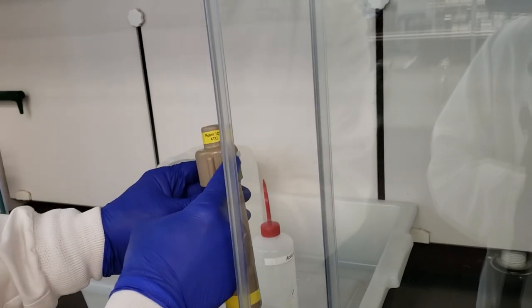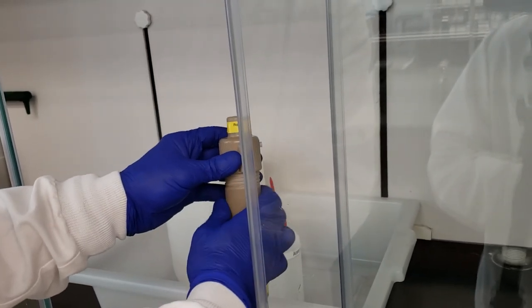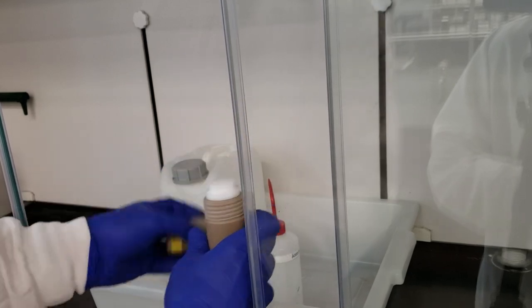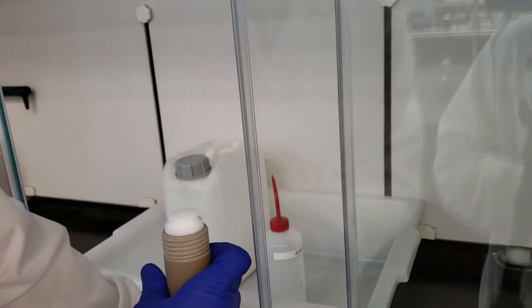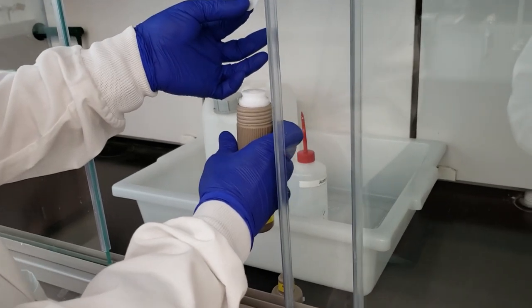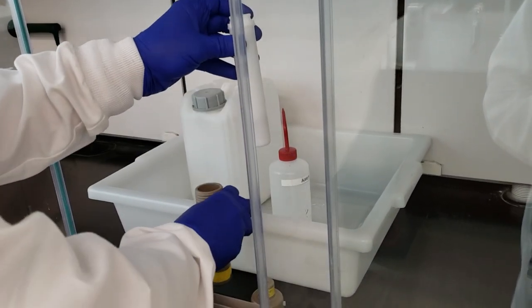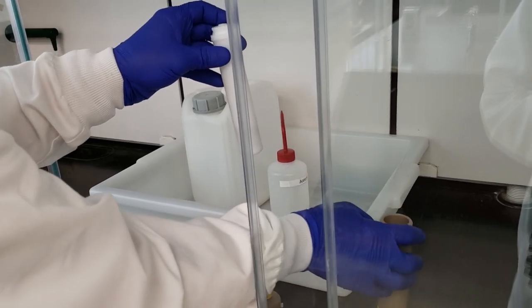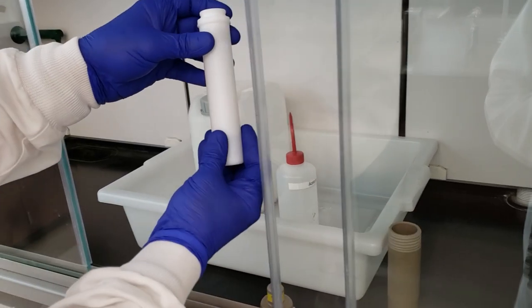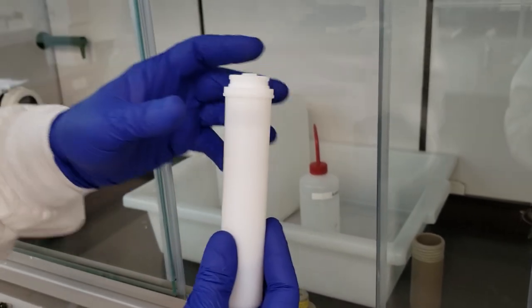We always hold our vent hole and aim that away from us just in case there is any pressure relief. What just fell out, of course, was our Teflon wafer. We'll go ahead and remove the inner sheath. We'll take this back to our workstation and begin the extraction.